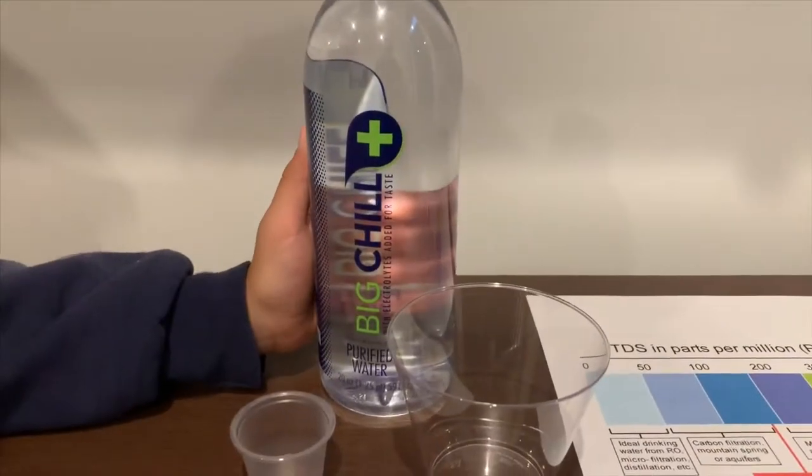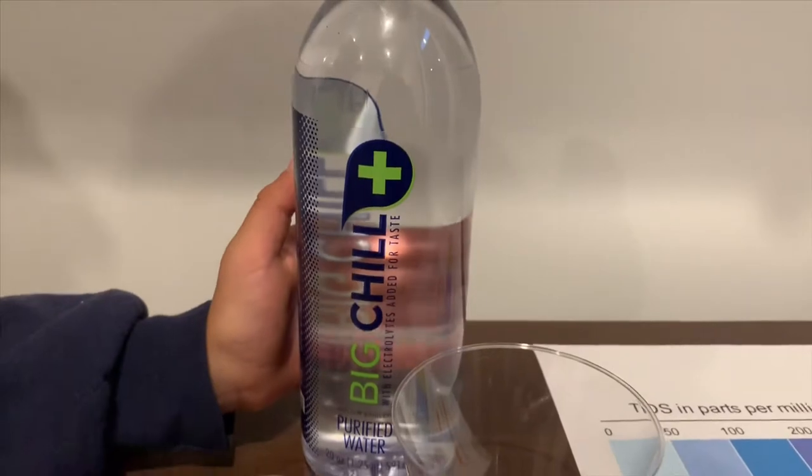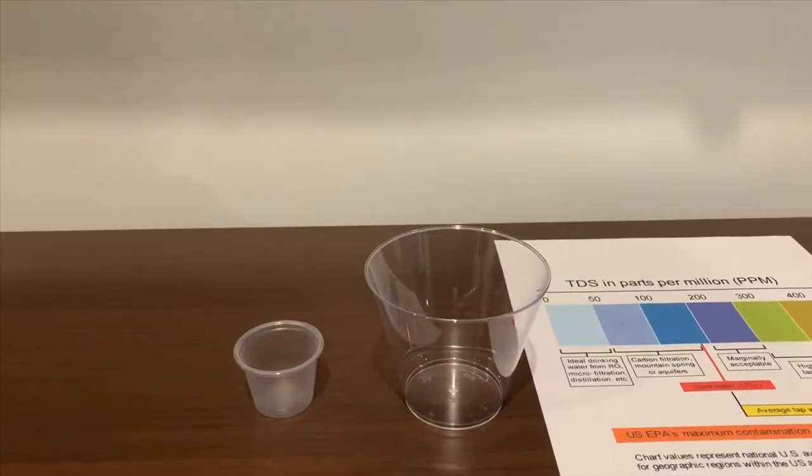This is Big Chill purified water with electrolytes added for taste. It costs $1.69. Let's test the pH and TDS levels.